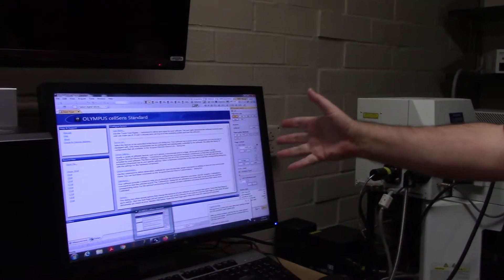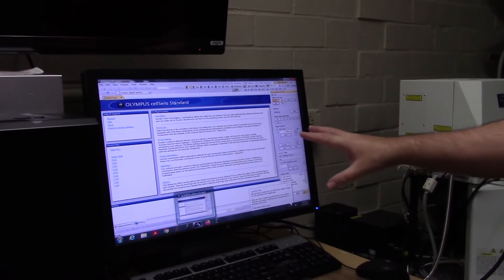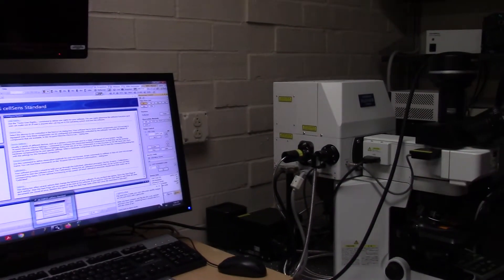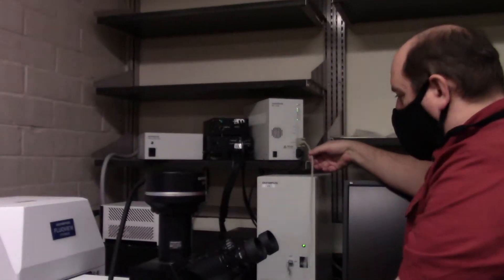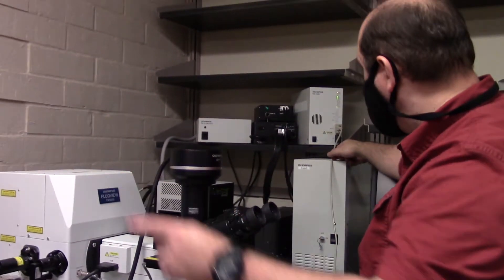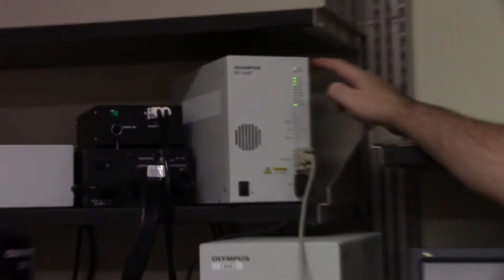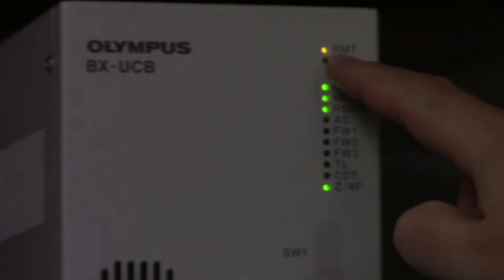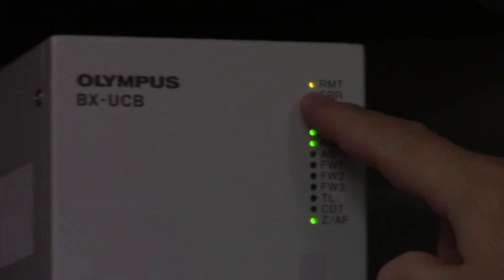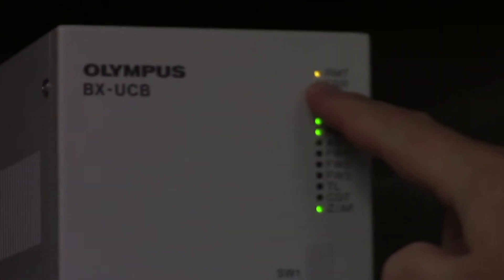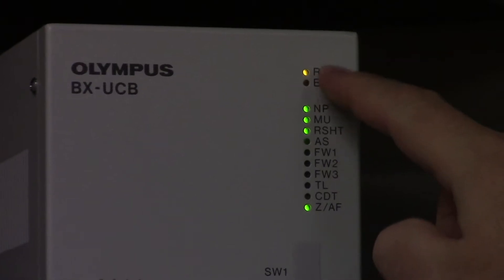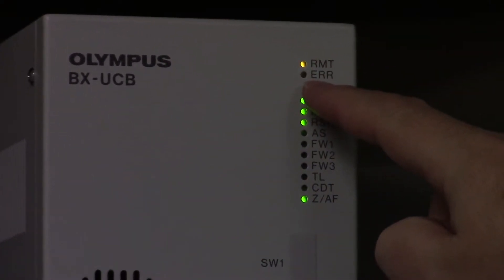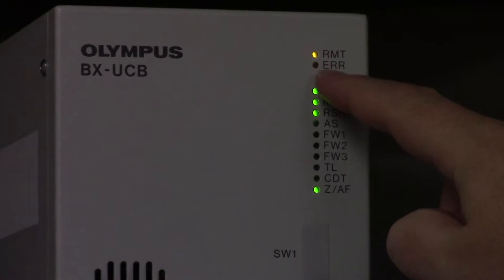Let me show you how this computer program is now controlling the whole microscope. I plugged into the universal control box into the back of that computer and now I've opened the program. The program has remote control. This light was not on earlier — this light is now on because the computer and the universal control box which controls the microscope are talking to each other.